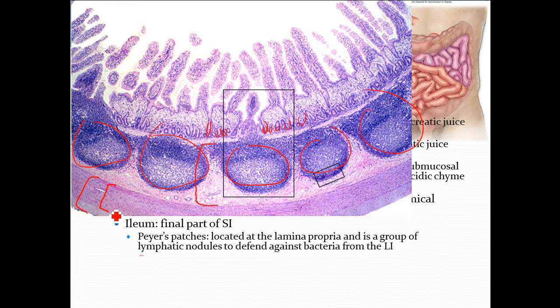This is the inner circular layer and the outer. No, the muscularis mucosae, we talked about it earlier. It's near the mucosa layer here. Muscularis externa. Okay, and then the layer underneath the inner circular layer is the outer longitudinal layer.